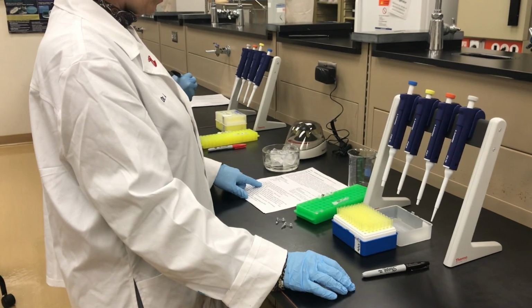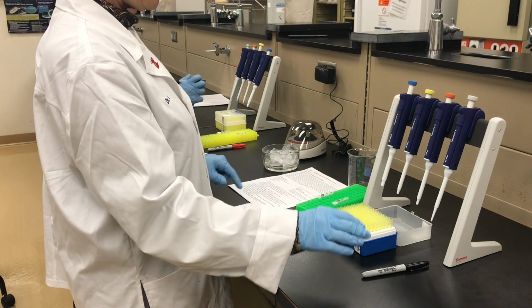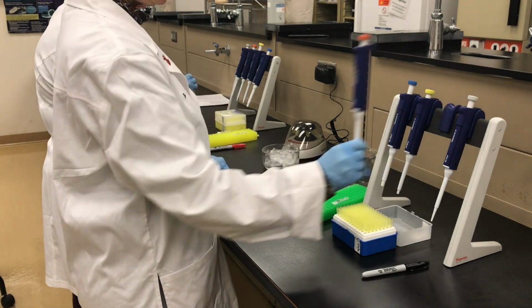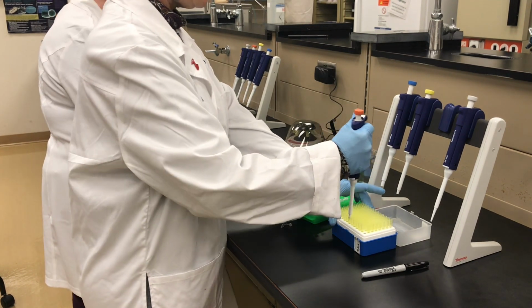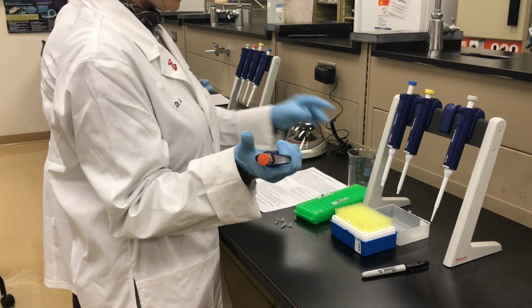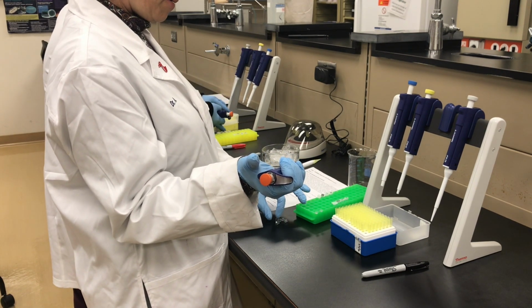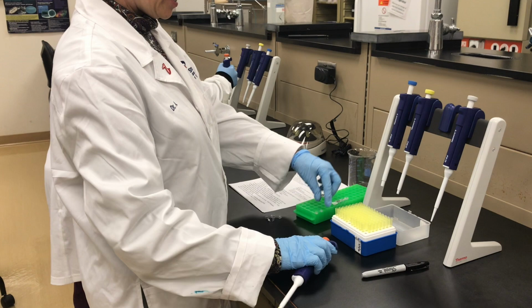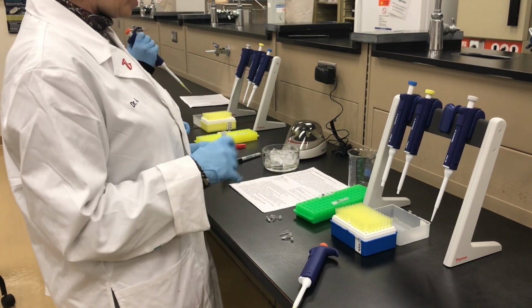Okay, we're on to step number 3. We're going to add 20 microliters of primer mix, which is a yellow liquid. For 20, I'm going to go with the orange top pipette. It's set at 20. Tip is firmly on. Oh, you know what? I got to do both of these. So what symbol did you use?